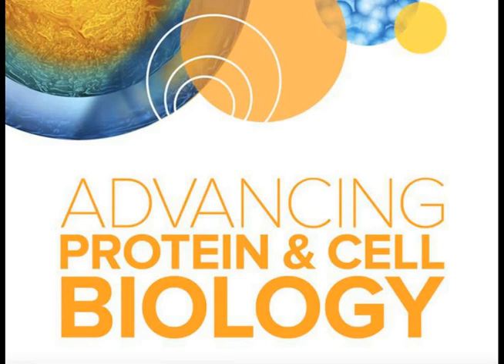I'm going to take this question. The question is, is 20x the highest magnification that this process can handle? What's the maximum mag at which images can be processed? There's no limit on magnification for images to be processed. I think for Oksana's assays, there was a benefit of the plate she was using and the spheroid size and things like that to do it at 10 or 20x, but the software doesn't care about magnification.